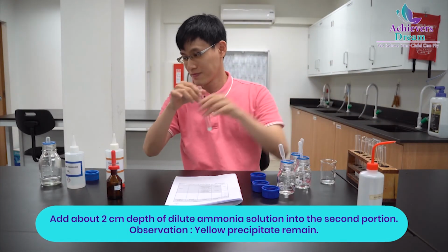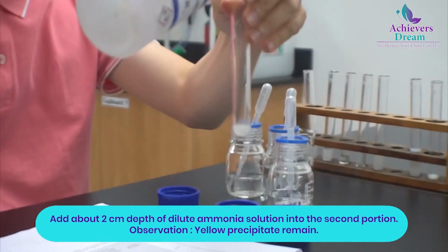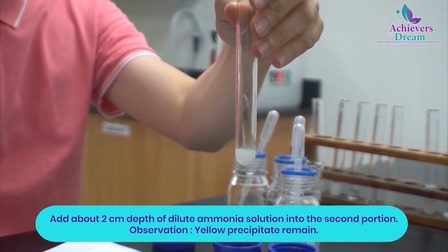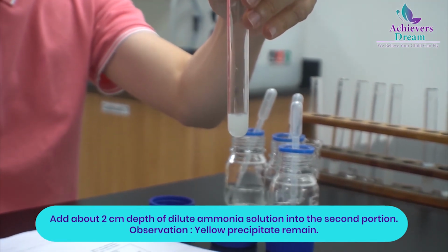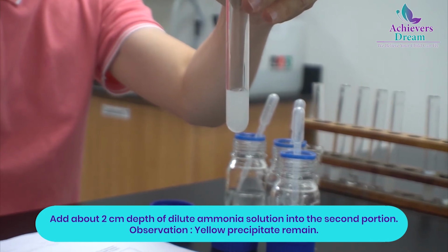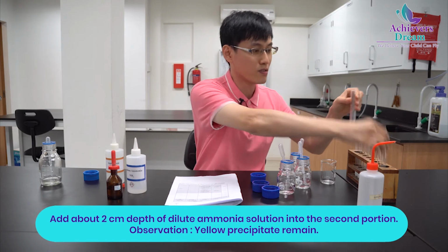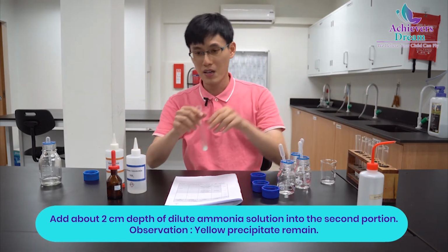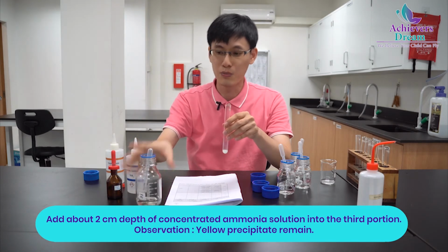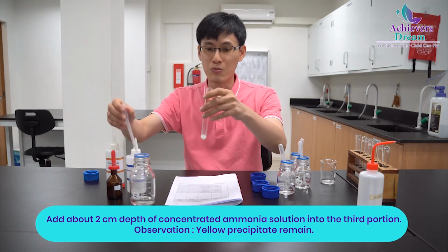Okay, how about dilute ammonia now? Here goes. As you can see, nothing's happening too, because silver iodide is the least soluble of all the silver halides. It's insoluble in both dilute and concentrated ammonia. So let's try by adding concentrated ammonia to see.